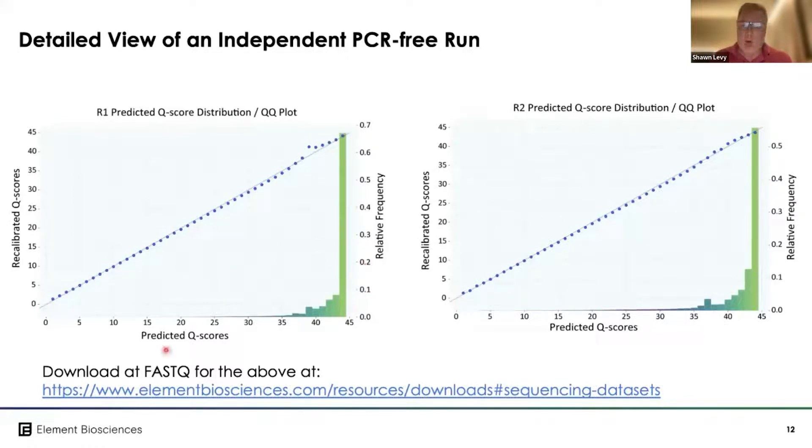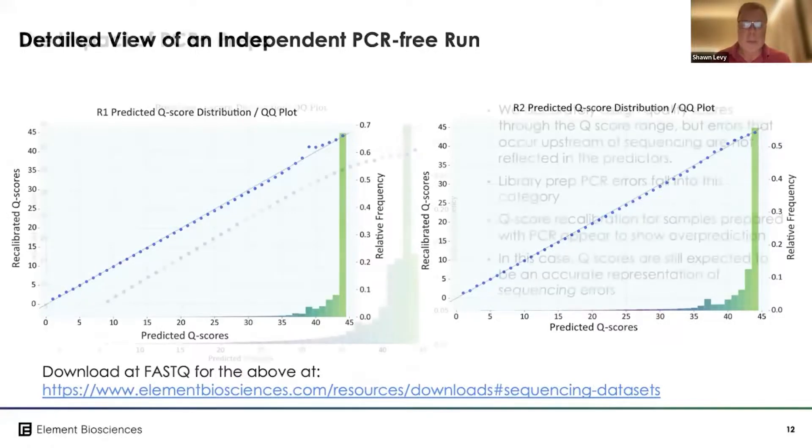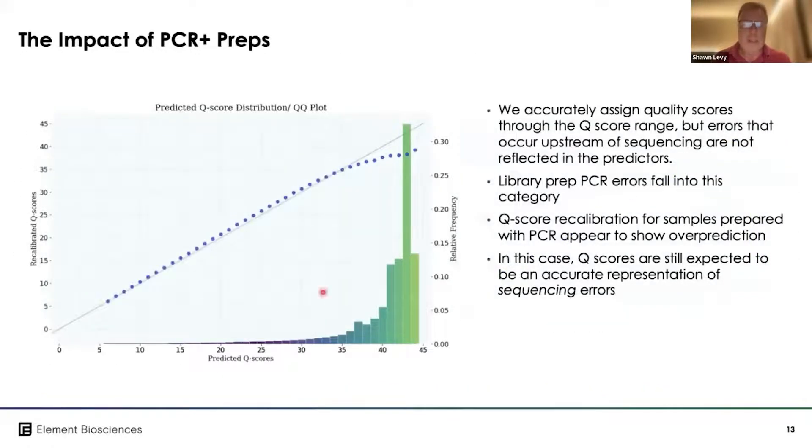All of this data is publicly available on the website, so anyone can repeat this analysis, and there are a number of other datasets available for different applications. If we do the same thing with a PCR-plus library, you can see that the sequencing accuracy is high enough that we start detecting library preparation-introduced errors, and we can see different levels of modulation off this curve depending on the PCR amplification kits used.